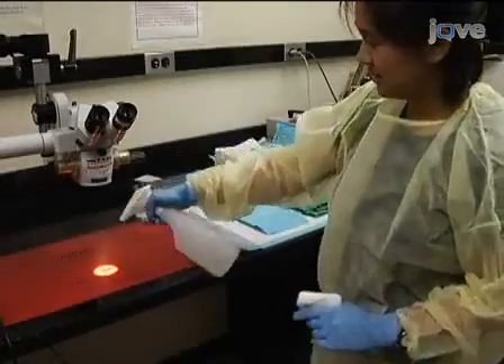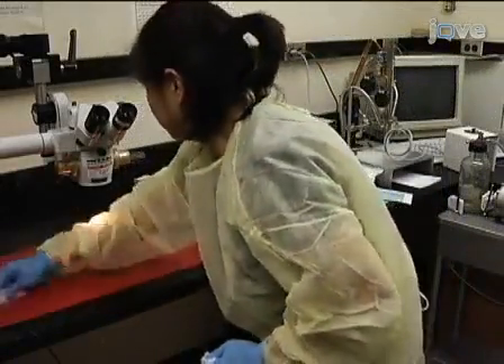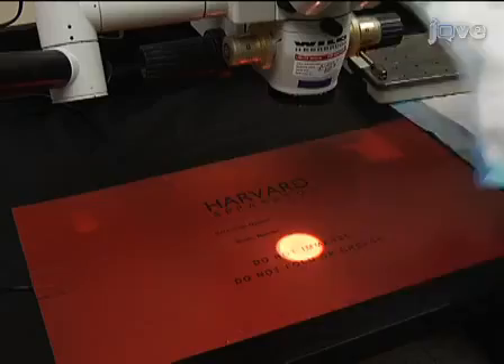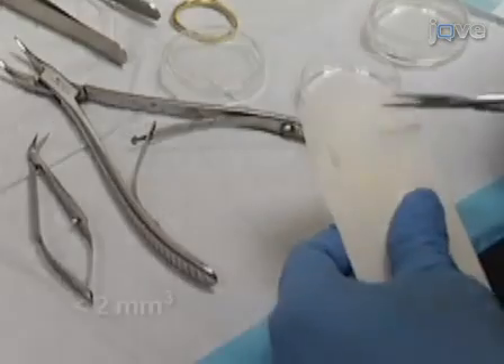To prepare for microscopic surgery, sanitize the surgical station and autoclave all surgical instruments. Prepare the thermal barrier and small, less than two millimeters cubed, pieces of gel foam.